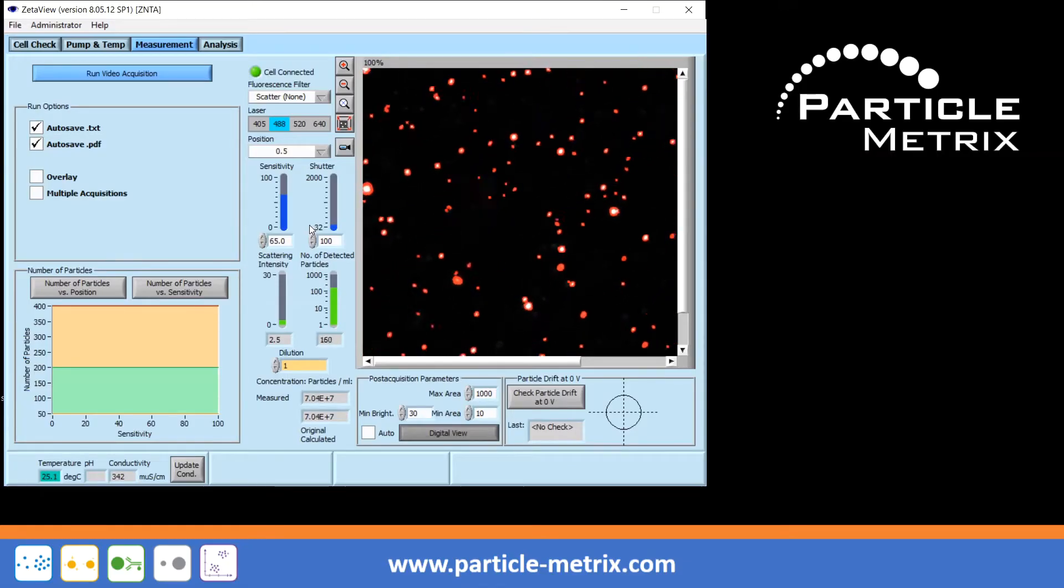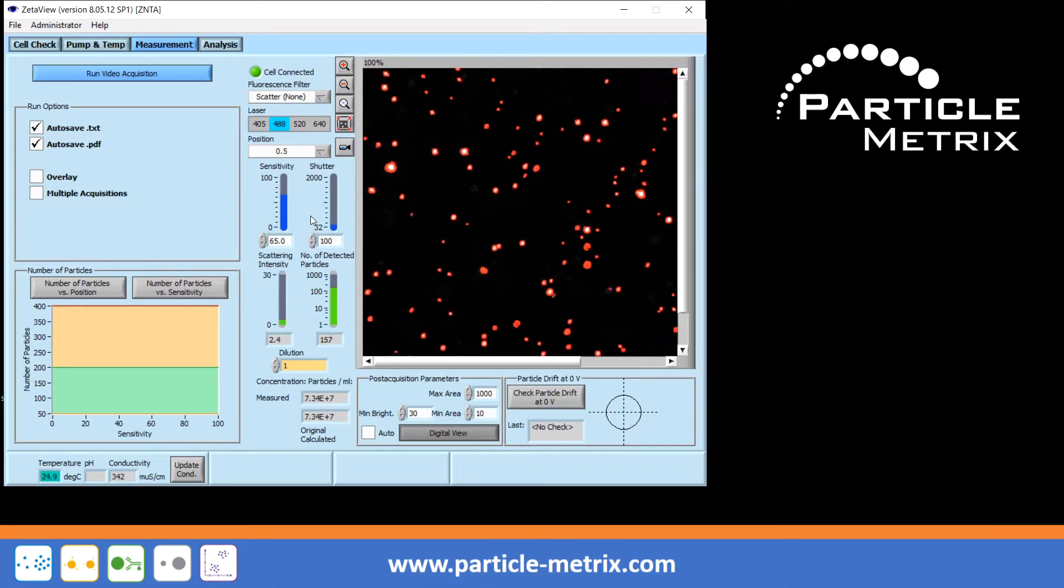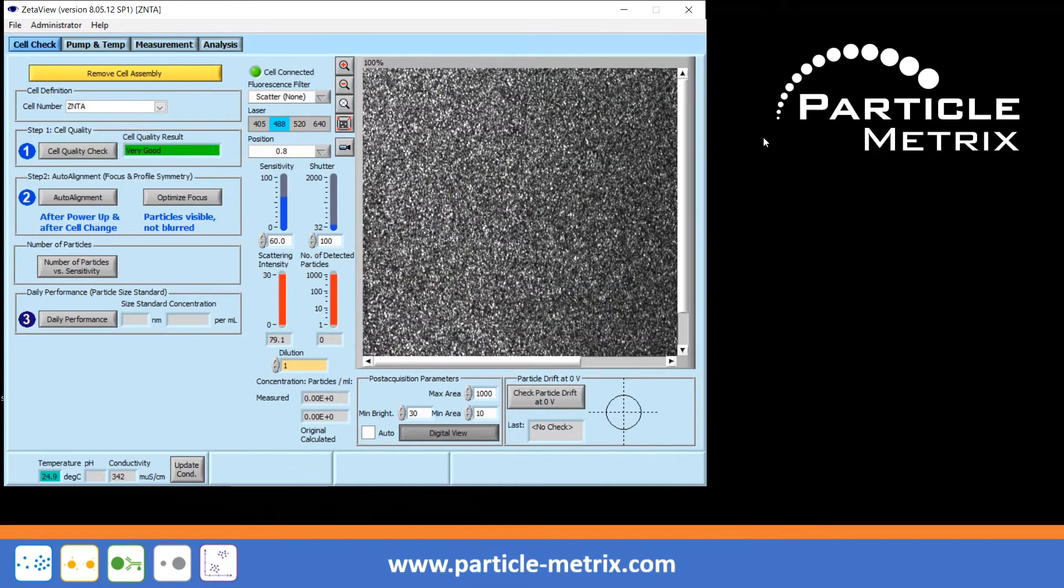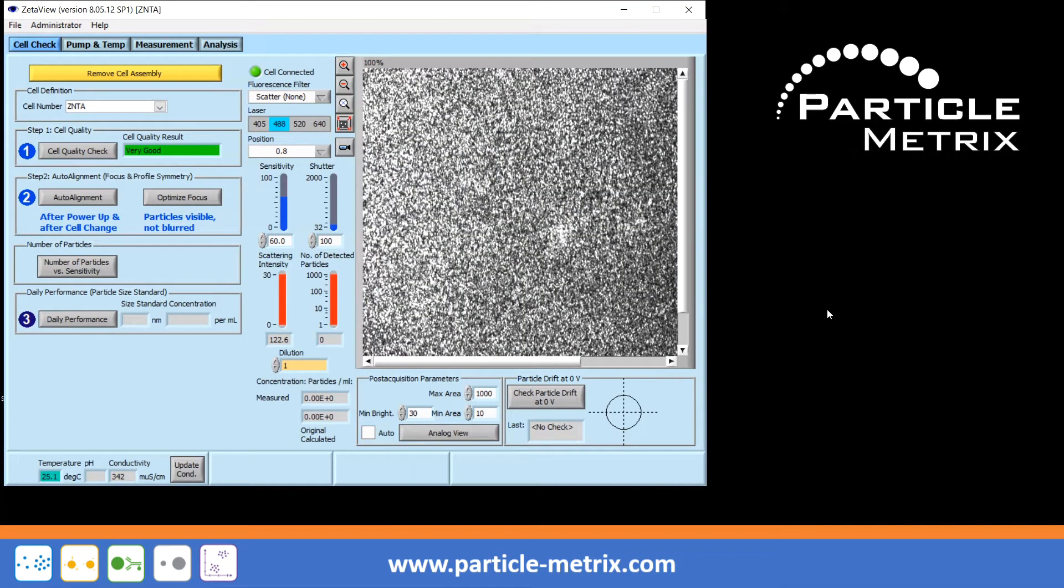Air bubbles in the measuring cell of the ZetaView instrument can appear very differently. For example, a grey or almost white background in the field of view indicates an air bubble.